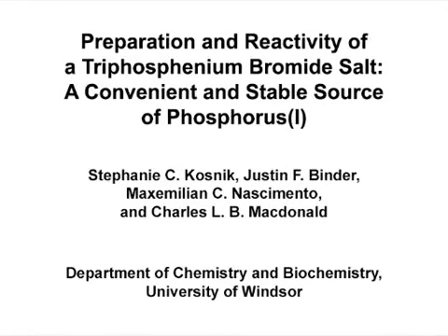The overall goal of this experiment is to prepare the bromide salt of a stable phosphorus 1 cation, which can serve as a convenient synthetic source of phosphorus 1 plus ions. The precursors prepared using this method have been used for the preparation of many types of phosphorus-containing molecules, with applications in inorganic chemistry, organic chemistry, and catalysis.